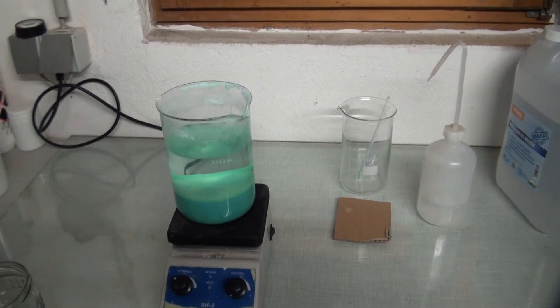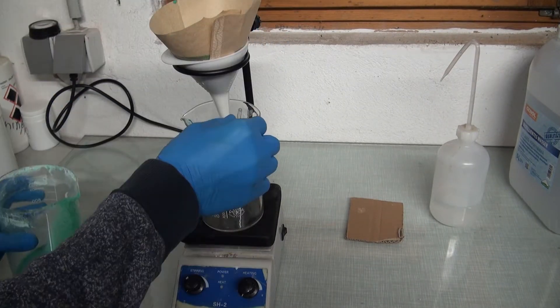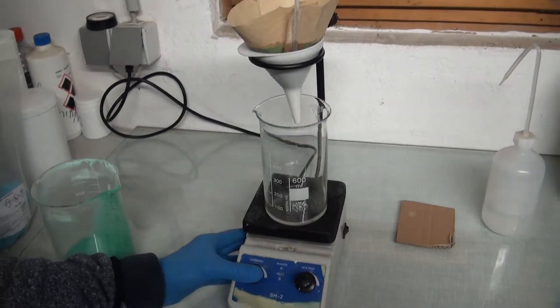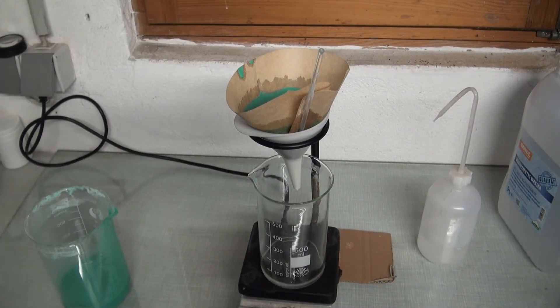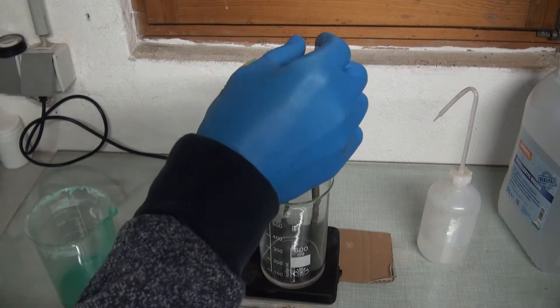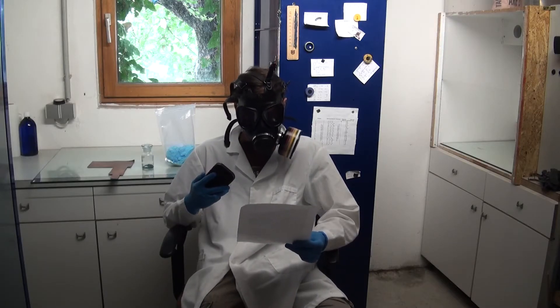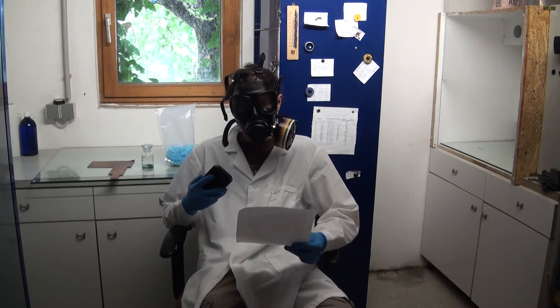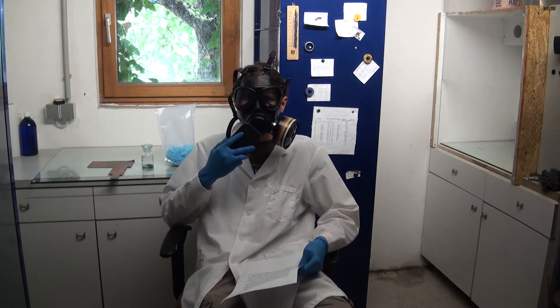The precipitate was next filtered and washed. I didn't bother drying it — it is going to get wet anyway. Don't take this out of context. Don't.